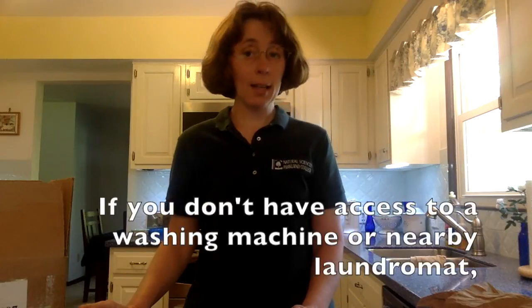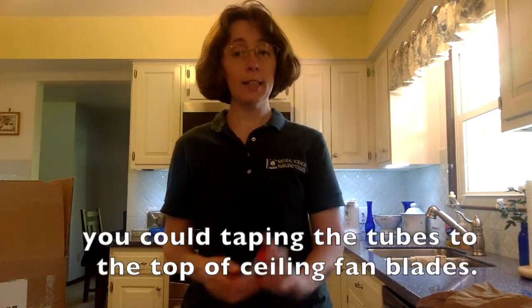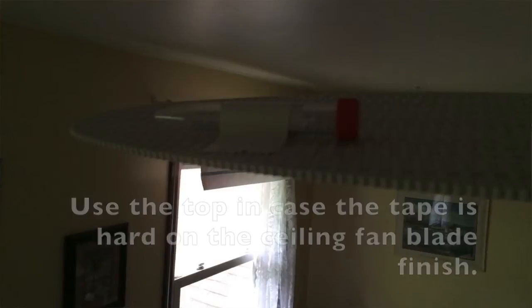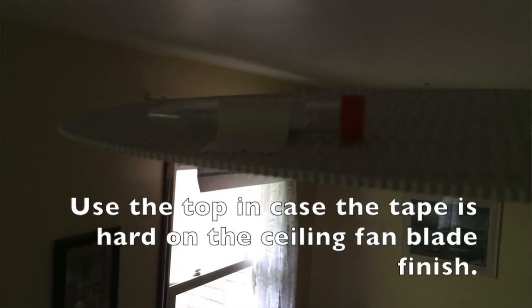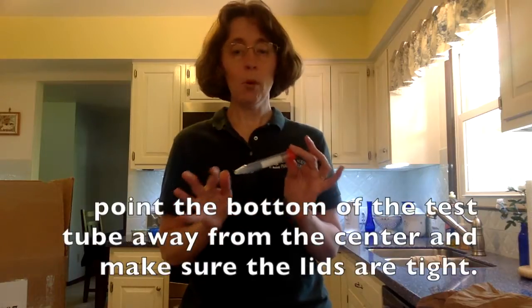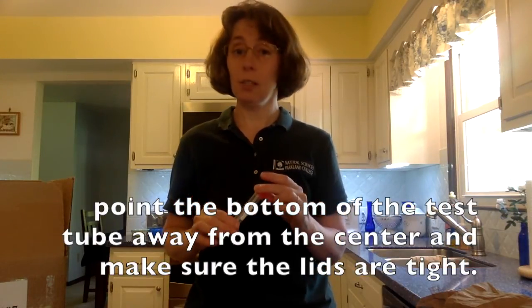If you don't have access to a washing machine or nearby laundromat, you could try taping the test tubes to the top of ceiling fan blades. Use the top in case the tape is hard on the ceiling fan blade finish. Point the bottom of the test tube away from the center and make sure the lids are tight.